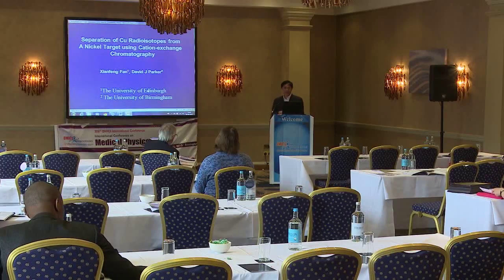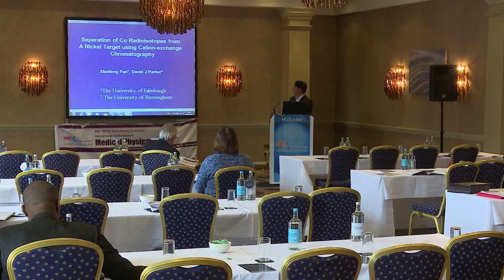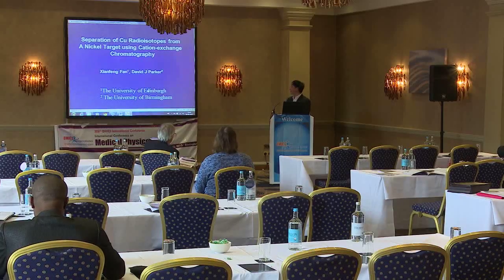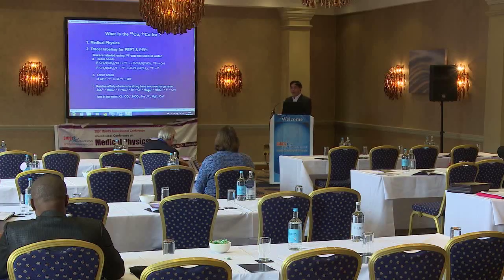So here I give one example for copper radioisotope: the separation of the copper radioisotope from a nickel target, using the technique we developed called cation-exchange chromatography. This work was done when I was at Birmingham University. Afterwards, I moved to Edinburgh University and teach there.